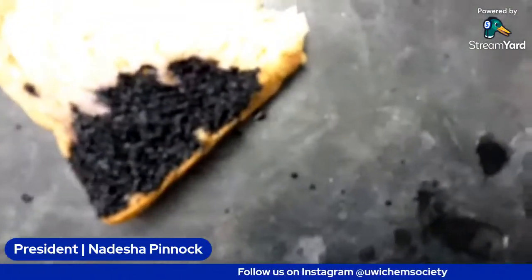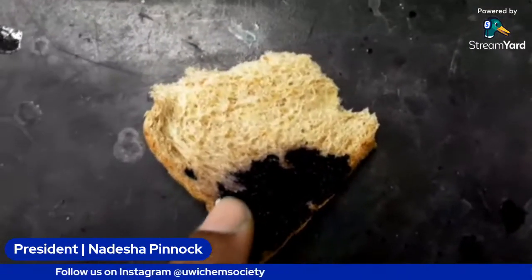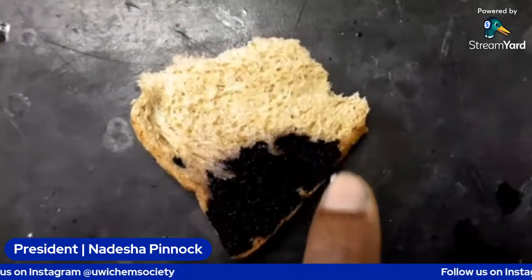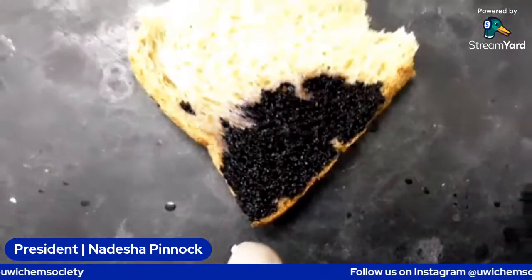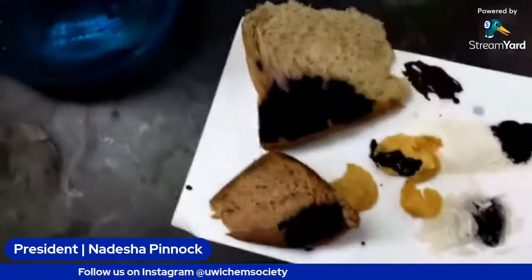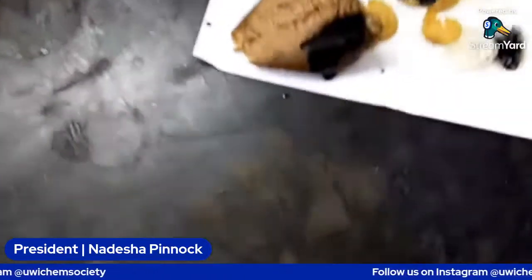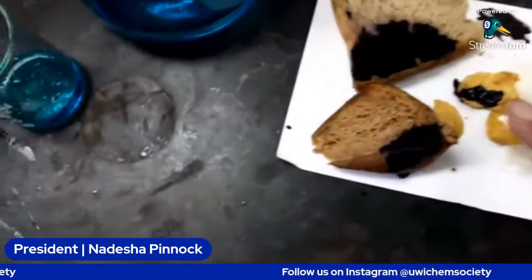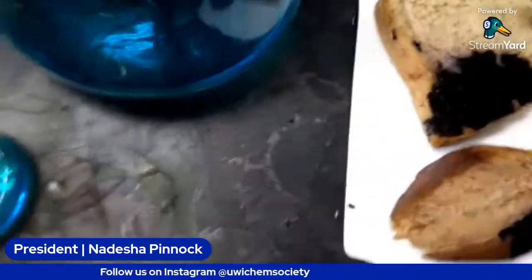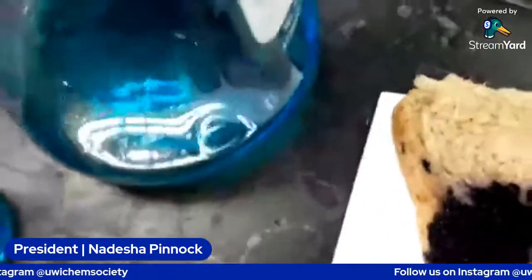So as I said, around the edge of the reagent, it looks a bit purple, but it's blue-black. So the starch test is pretty straightforward and simple. So we use some cereal, some rice. This is cornflakes, bun, and bread. I think the bread is the clearest one.